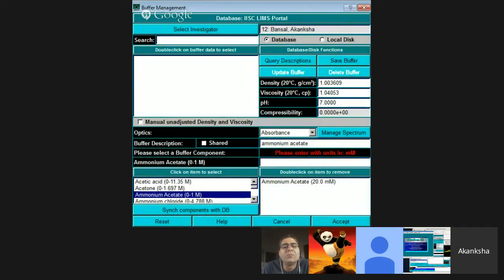I'm going to go back to myself now. Boris? Yes? Can I ask a question? Sure. So when I prepare buffer, I normally titrate Tris with hydrochloric acid, but this could also influence density, right? Hydrochloric acid? Yes. I would think a little bit. It probably isn't very much. How much do you put in there? Just a few drops for pHing?